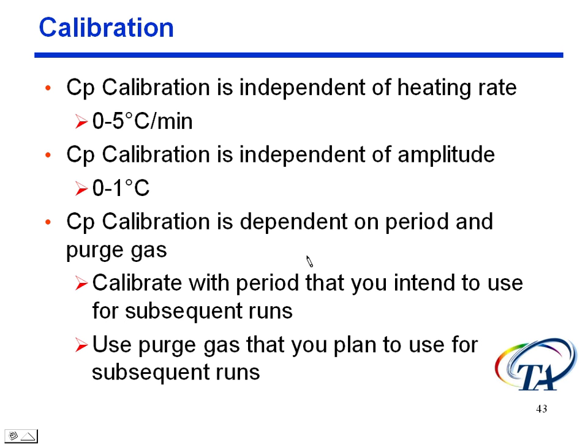And whatever purge gas you're going to use on your subsequent runs is what you want to use, because this will affect it, whether it's helium or whether it's nitrogen. Those are probably the two most common.